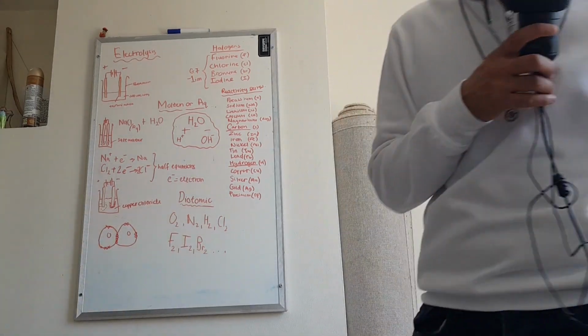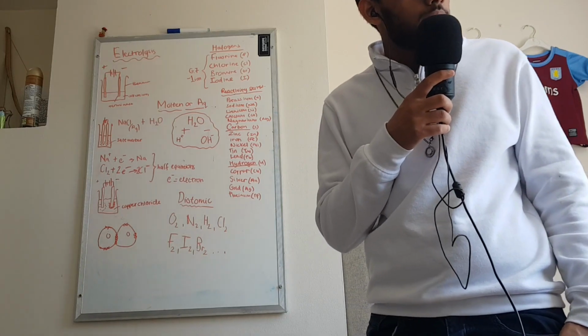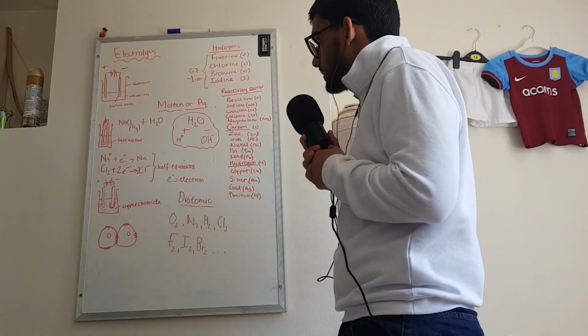You won't get any... one second, my piece is just off. You won't get any reactions. You won't get anything really forming beyond that. What else do we need to go over?